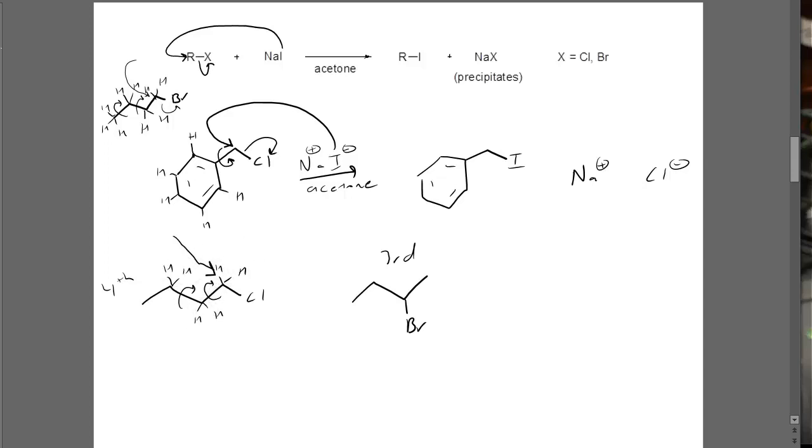So this was 4th, and then I said our 1-chloro-2-methylpropane was expected to be 5th. So this compound was expected to be 5th, even though we didn't see any precipitate. When you're giving your explanation, go ahead and justify the total order of all 7 substrates. This was expected to be 5th because looking at this carbon, we have a carbon attached to 1 carbon. This whole compound is a primary substrate. So our chlorine is attached to a carbon that only has 1 carbon attached to it.